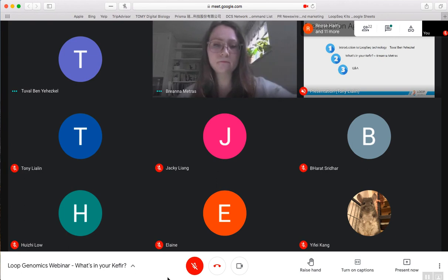Okay, I think you see there, some of the questions are just still coming in. As a follow-up to the recovery rate, if we downsample to 10 to 30,000 molecules, will the kit produce 100% of the 10 to 30,000 molecules full length? Yes, it will. So whatever number of molecules you choose to sequence, whether it's 10,000 or 30,000 or 300,000, that is the count of the full-length molecules that you'll get.